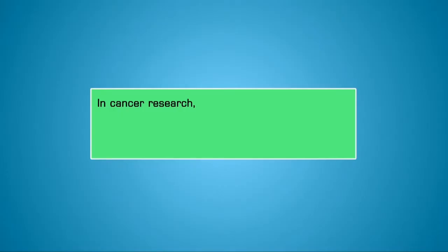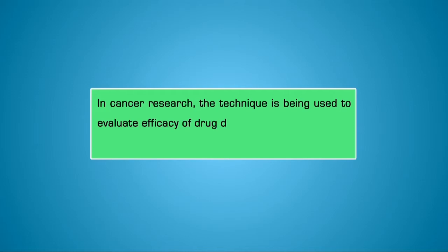Since they do not require the use of animals and are relatively inexpensive, and as it enables screening of a large number of drugs, the technique is being employed in a wide area of research over recent years. In cancer research, the technique is being used to evaluate efficacy of drugs during drug screening and development.